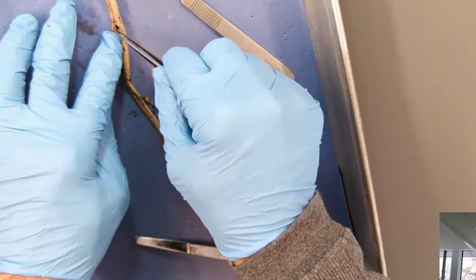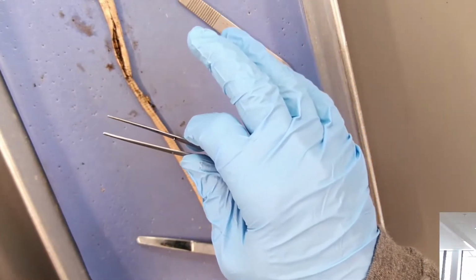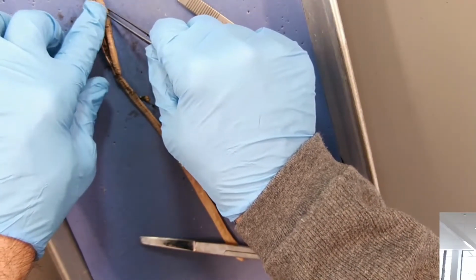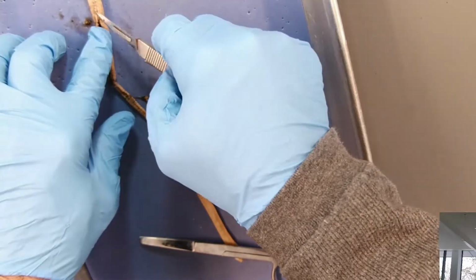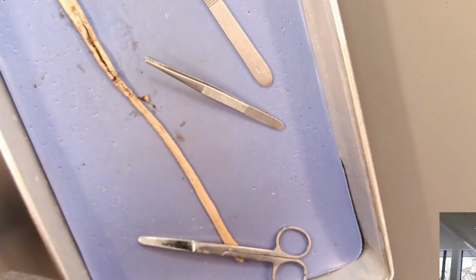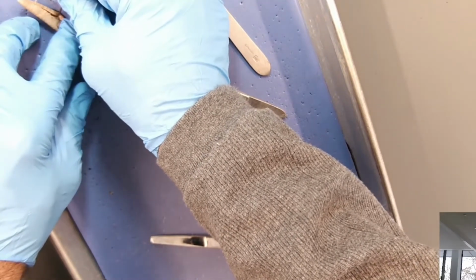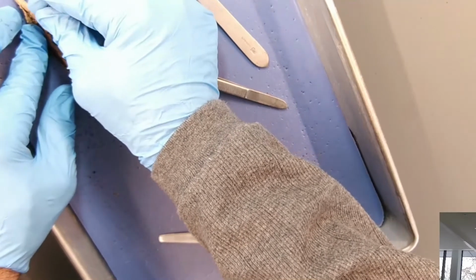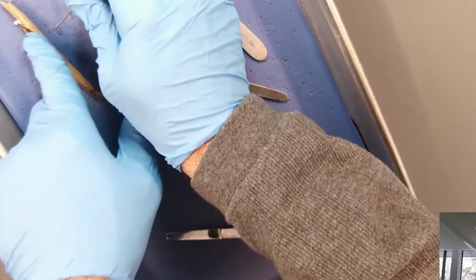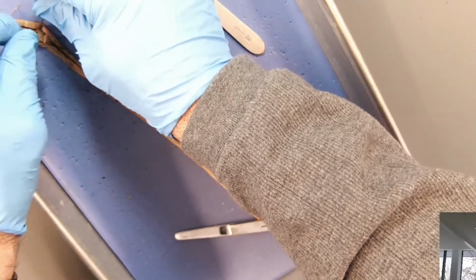Well, when I opened this up, a lot of black gunk came out, which leads me to believe that the preserving of this particular one wasn't very good. I'm going to open it up and see. I may have to do another one. Okay. But we can try it. I'm going to try to pin it and see if there's anything here we can look at. Whoops. Maybe it'll be okay. Yeah, ye have little faith. It's looking better than I thought it would.